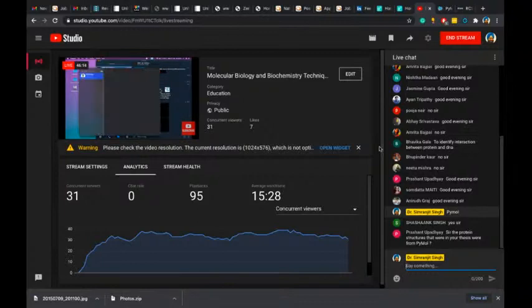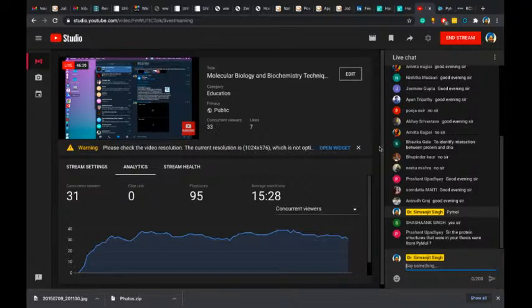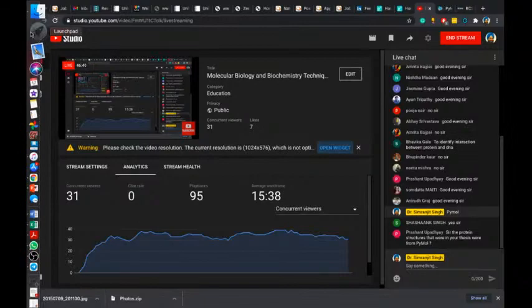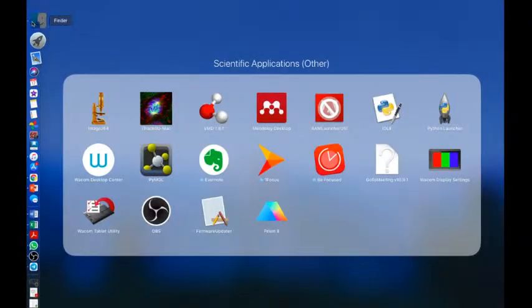the purification first, how we purify, quantify, how we extract these proteins. The structures were from PyMOL only. So this made my life quite easy. If you go into advanced level, you can check the distance between each molecule, each amino acid. So my work in my thesis was to identify the disulfide bridges.